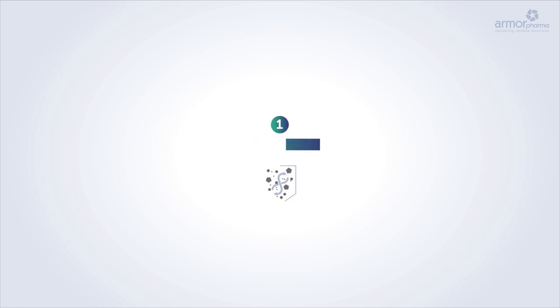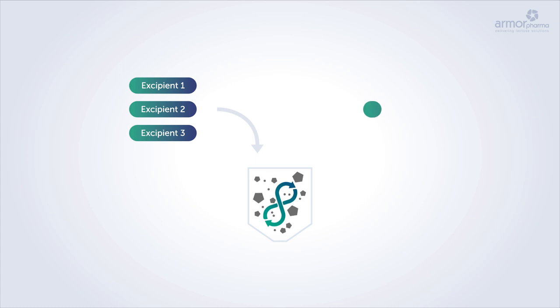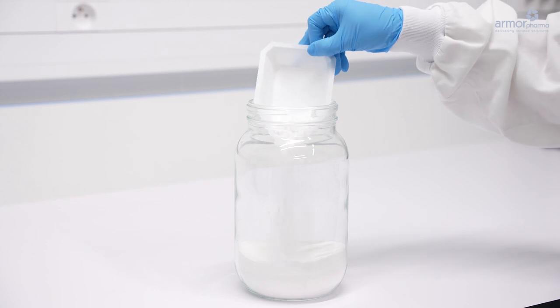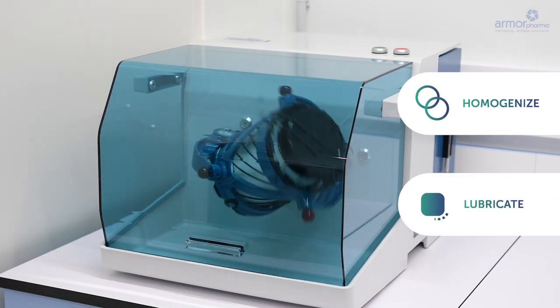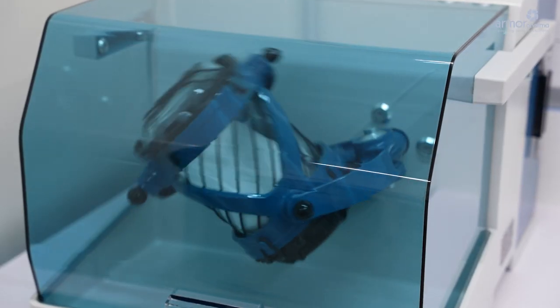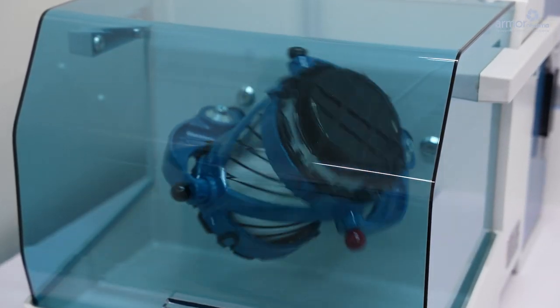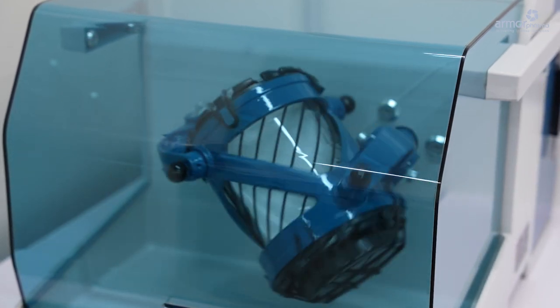Blending: Powder blending is an important step in formulation development as it ensures homogeneity and accurate dosing. Lactose and other excipients are mixed in a Turbula blender to homogenize and lubricate the formulation. The Turbula is a low shear blender with a 3D movement. The mixing process is gentle.